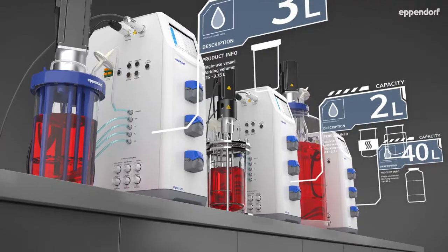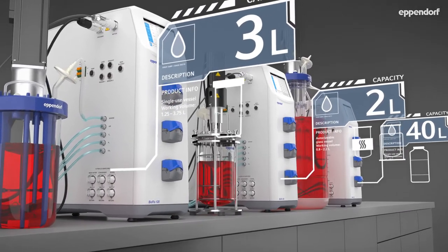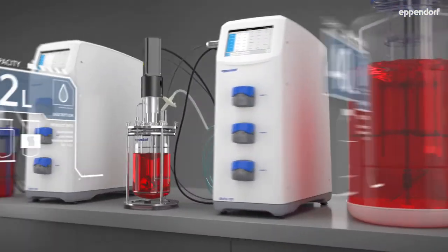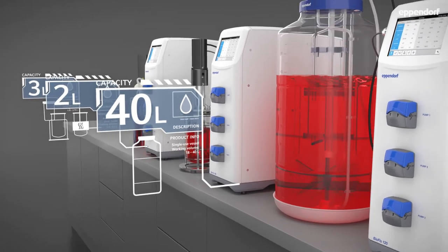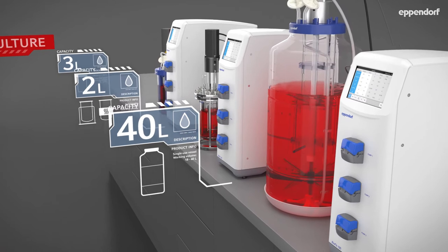The benchtop scale of bioprocess equipment requires a certain level of flexibility for the user to meet the changing needs of today's laboratory environments. When we designed the BioFlow 120 bioprocess control station, we clearly had this flexibility in mind. The BioFlow 120 is capable of running a wide variety of heat-blanketed and water-jacketed glass vessels, and being compatible with Eppendorf BioBlue single-use vessels, it provides an impressive working volume range of 250 milliliters through 40 liters on a single platform.